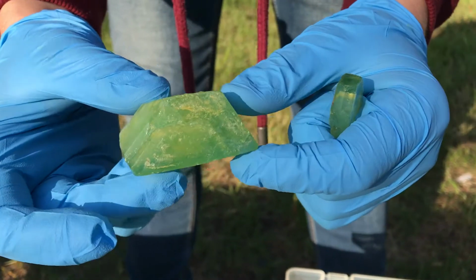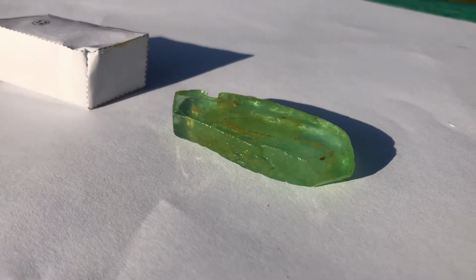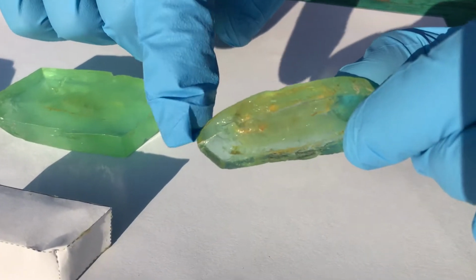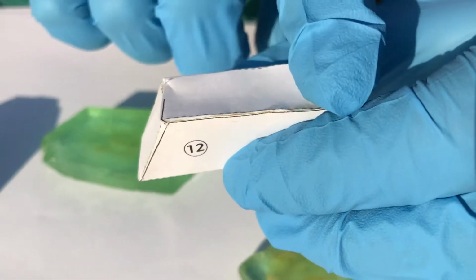I have 2 more crystals, and as it can be seen, one is more transparent and the other has a completely different form. The more transparent one was one of my experiments. As you can see, it has a rounded edge. As it was initially thought, you cannot change the shape of a crystal that is determined by its crystal lattice.